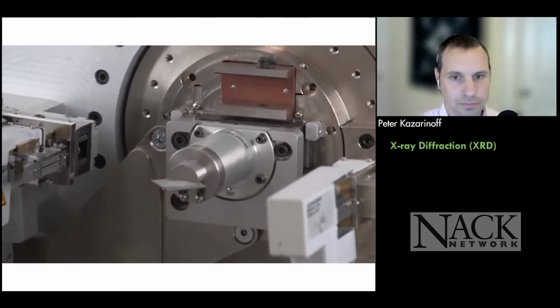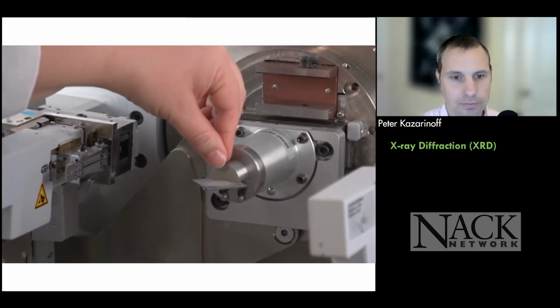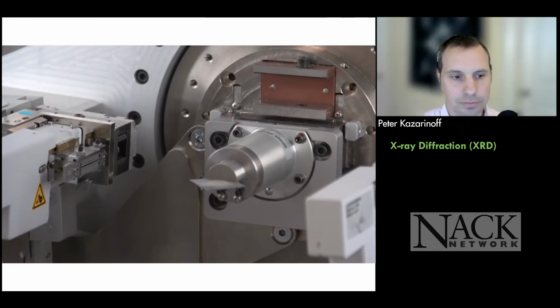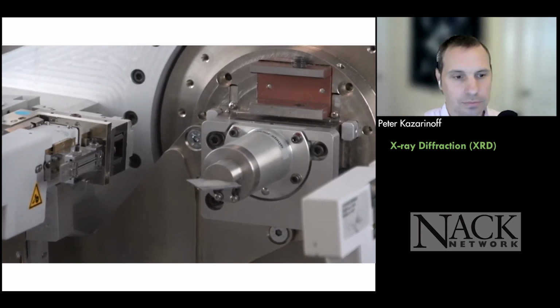We want to leave on this particular instrument a slight gap between the back of the holder and the sample that's maybe 5 to 10 millimeters in depth. So in that video, what you could see was Nicole mounting her sample in the X-ray diffractometer.